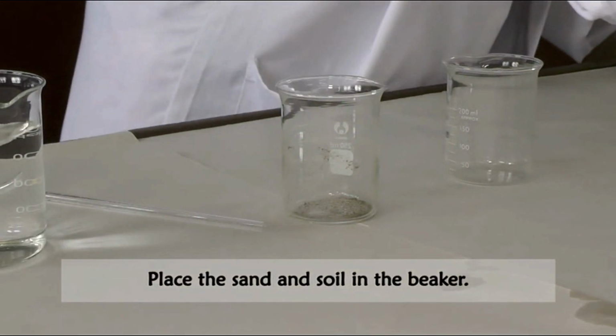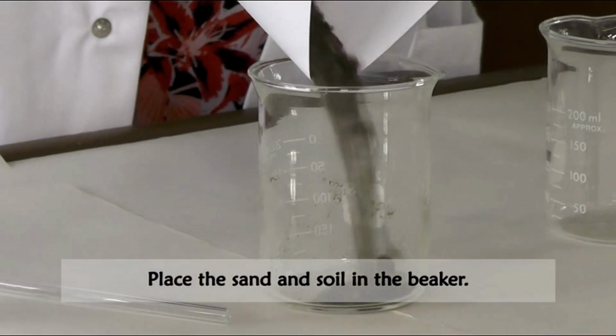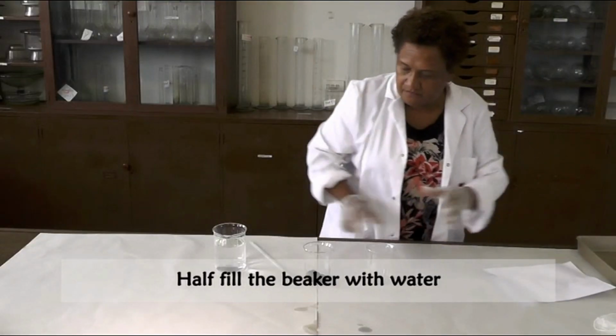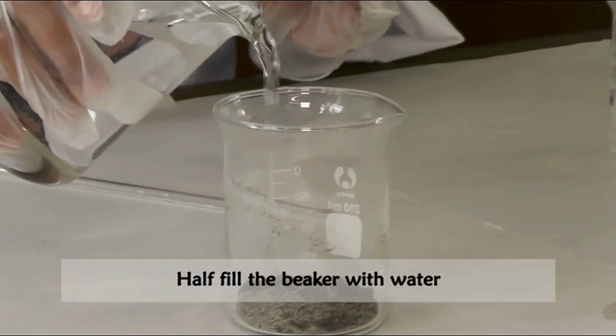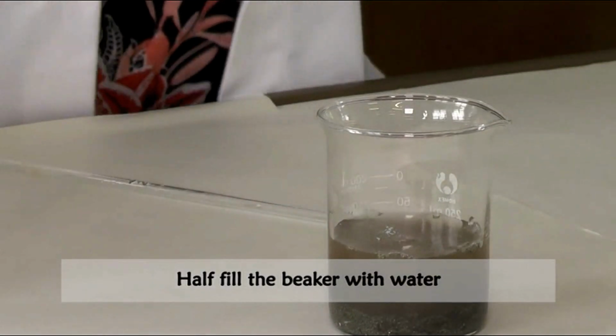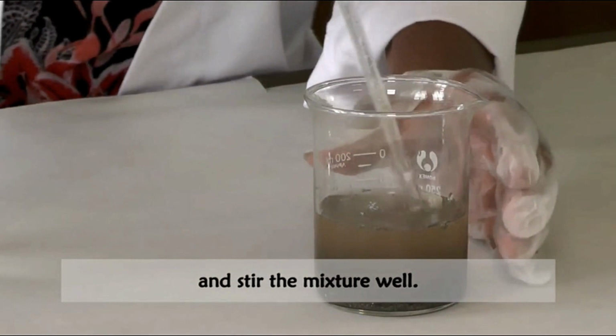The method: place the sand and soil in the beaker, half fill the beaker with water, and stir the mixture well.